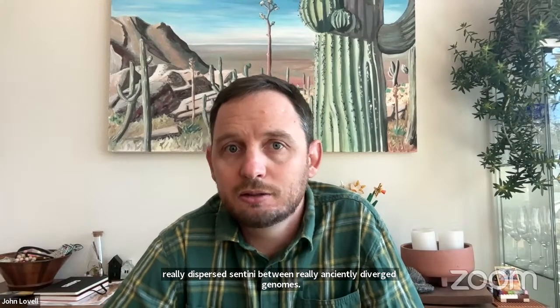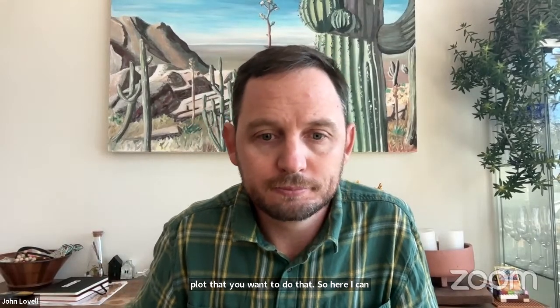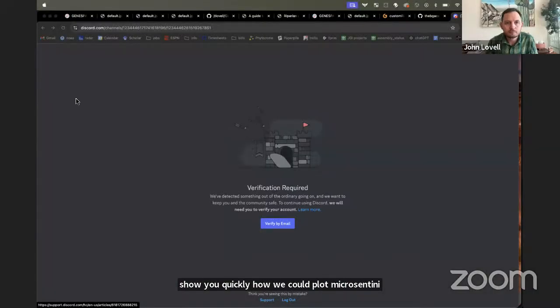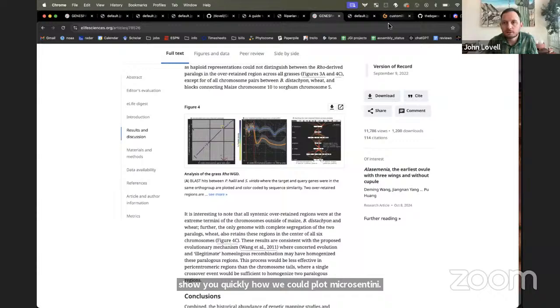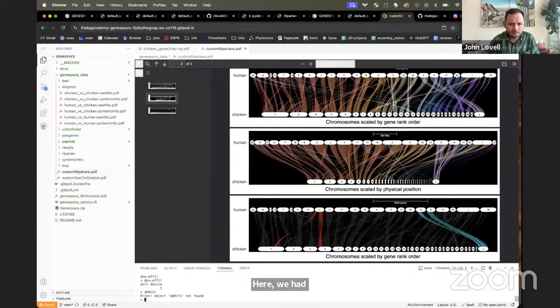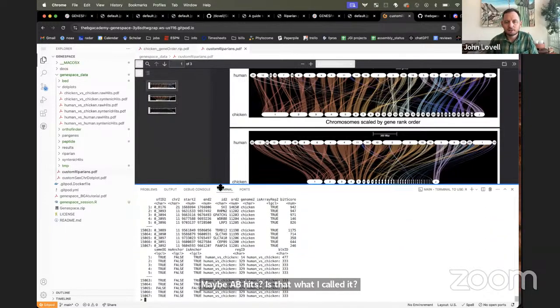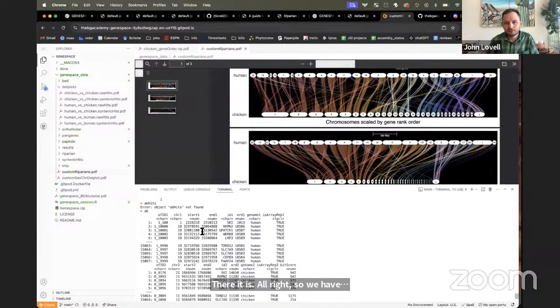In the first case, yeah, you can choose whatever you want to plot. You read in the hits and then you use gghits or just any plot that you want to do that. So here I can show you quickly how we could plot microsynteny. All right, so if we go into here, we had, what did we call it? Maybe AB hits. Is that what I called it? There it is. All right, so we have these hits that are AB.